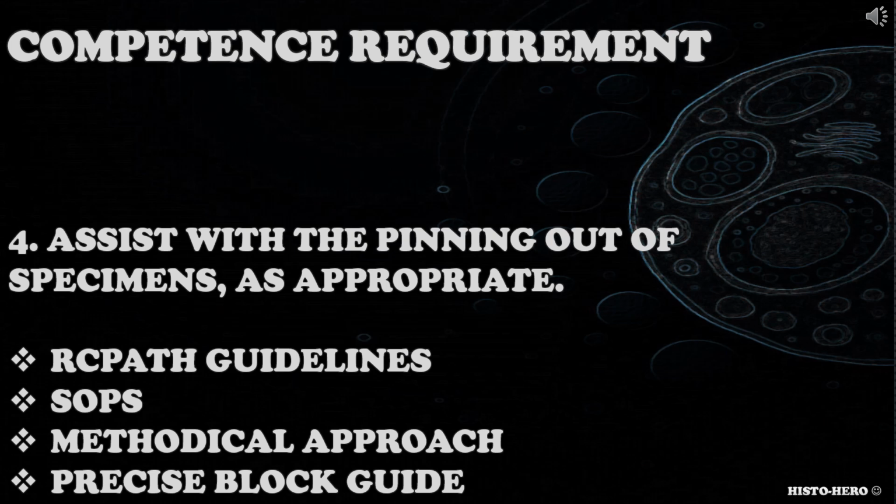How are those samples approached? Why is the methodical approach for dissection of pinned out samples important? What would happen if those samples were not dissected methodically and precisely? What are the RC Path guidelines for pinning out specimens?